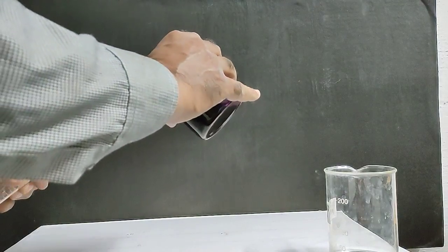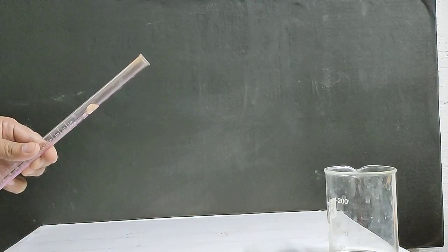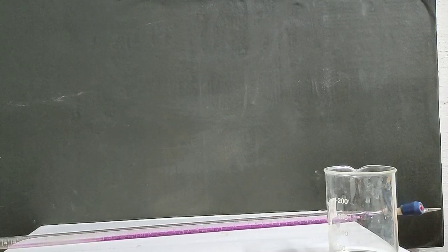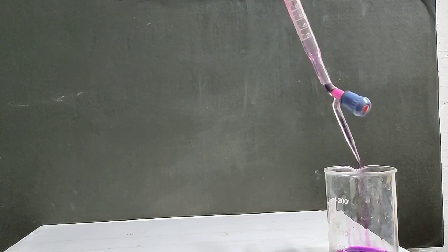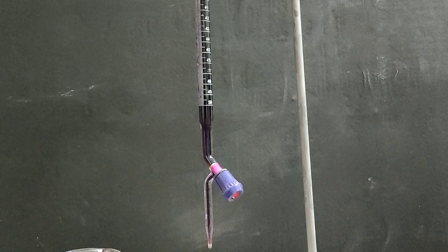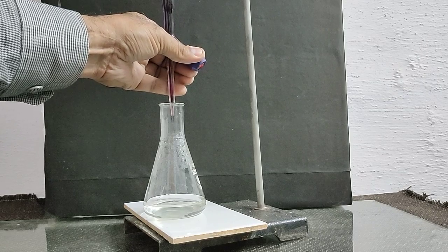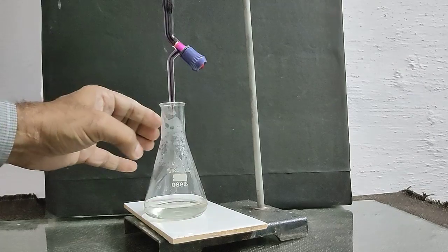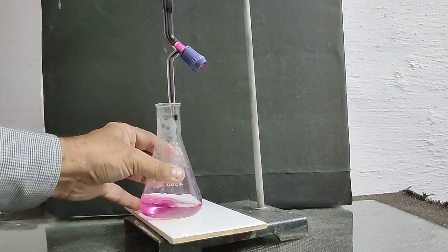Rinse the burette with unknown solution of potassium permanganate. Discard the liquid. Fill the burette with unknown solution of potassium permanganate. Set zero level at upper meniscus of KMnO4. Start titration by adding drop by drop KMnO4 into the conical flask. Color of potassium permanganate disappears. Adding KMnO4 in small amount by shaking the solution.